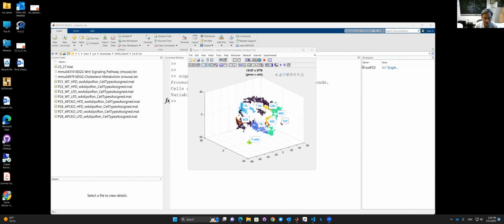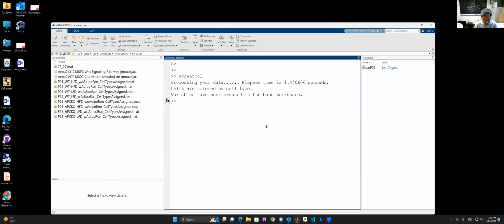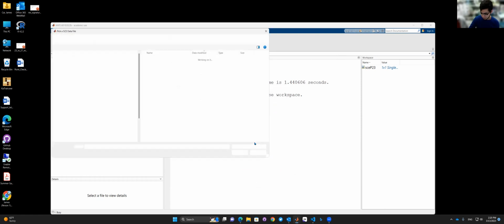So what can you see? Can you see everything? Yeah, I can see your desktop and also those cells. Okay, that's good. So now I can finish this part 23. I can shut this down and then do that again for 27. Can you see this window right now, this dialog? Okay, good. Yes. I think it's back to normal.